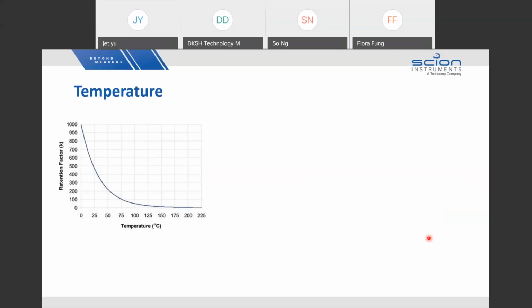So temperature is applied to, and will affect, the entire analysis from the very beginning to the end. Okay. Generally, you increase the temperature, so the analysis is also faster. Okay, much faster. All right. Then you are also able to achieve fast analysis, but of course, behind the change of temperature, you have to think about the resolutions. Okay. So usually the temperature change we will modify from the middle afterwards. Okay, because at the very beginning the temperature is already quite low.